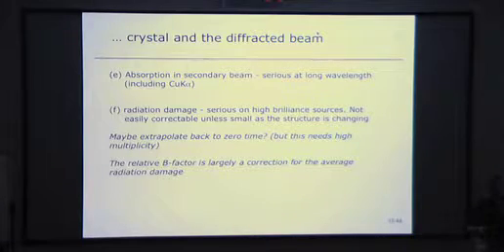Extrapolation back to zero time was popular a few years ago. I don't know if people do it. No. If you need high multiplicity, then you will have more radiation damage. Yeah, unless you really reduce your exposure time. Yeah. You cannot have high multiplicity. Yeah. This is why you need to design your experiment, because the data collection is an experiment.